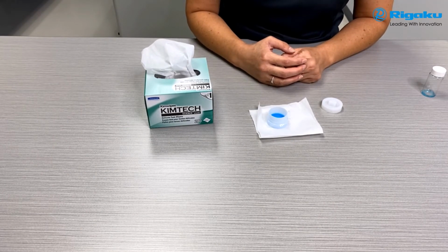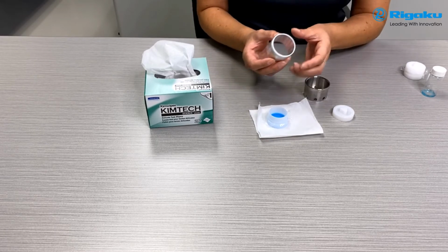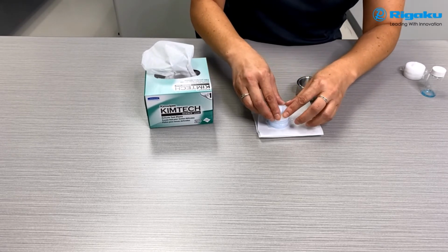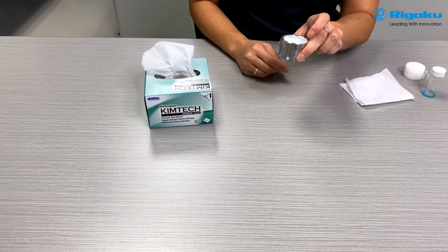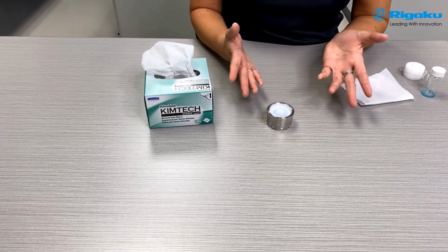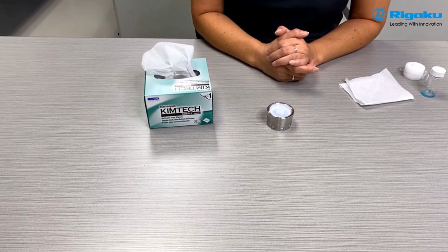Right. And if it's the first time they're running the sample, it might be good to try our secondary containment cups, just because it'll give them that extra bit of protection. You can use a different type of film here as well. We've shown this on another episode. It slides right into your Super Mini, and then you just place your cup inside that secondary containment cup to help with any leaks. That's a really good point, because it just covers your bases. They would only do that maybe the first time they run it, just to test it out. We recommend that you definitely test it out first, and once you're good to go, you may not even need the secondary containment cup, and can go with just your cup with the film by itself.